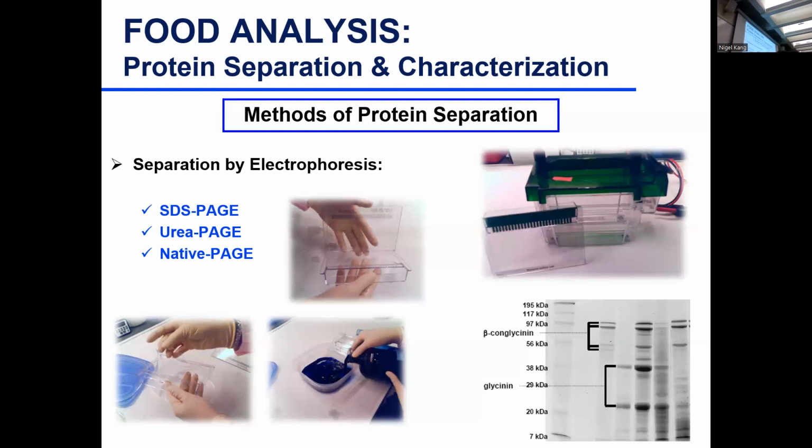There should be a solution to keep it wet first, and then dye the bands so that you can visualize it and scan the gel to work with the bands. That results in this visualization of your protein. You have a faint blue background, and then your protein bands are navy blue.